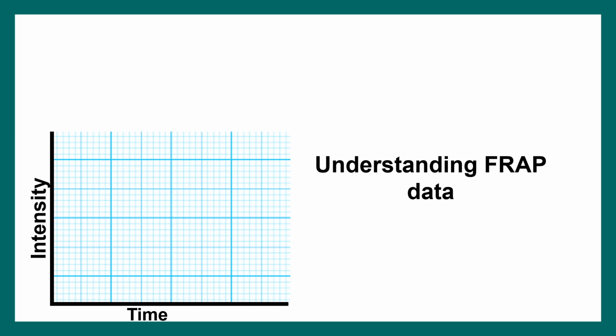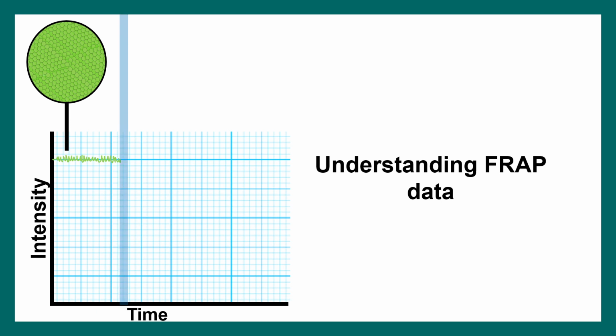This can be understood in the format of a graph, so let us try to understand this graph to interpret the data. This is how the normal baseline fluorescence looks, when we are imaging the overall membrane patch. We haven't exposed the high intensity laser yet. Now we put on the high intensity laser, and it bleaches a portion of the membrane, as expected.